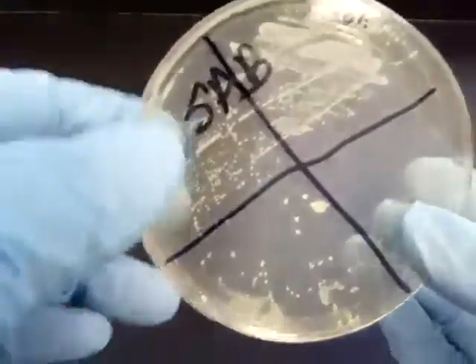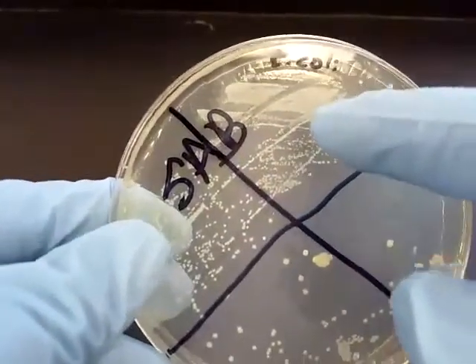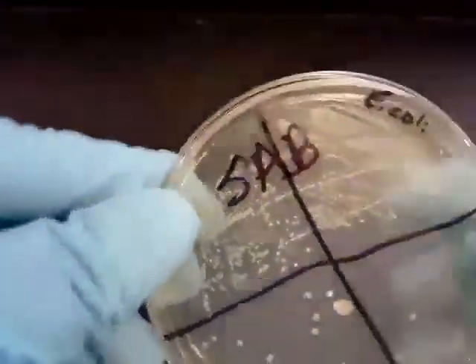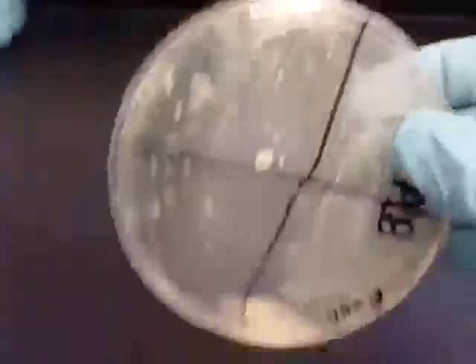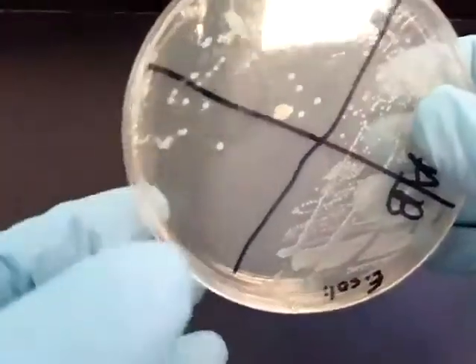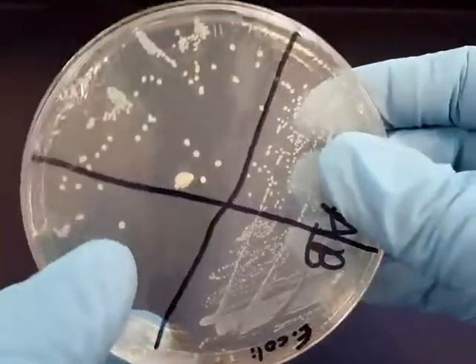So looking at the plate more closely, you can see that this is the original quadrant that the bacteria was put in. It was streaked into this quadrant, and then streaked into this quadrant, and then finally into this quadrant. Each one of these little dots is a colony. So now we have isolated colonies.